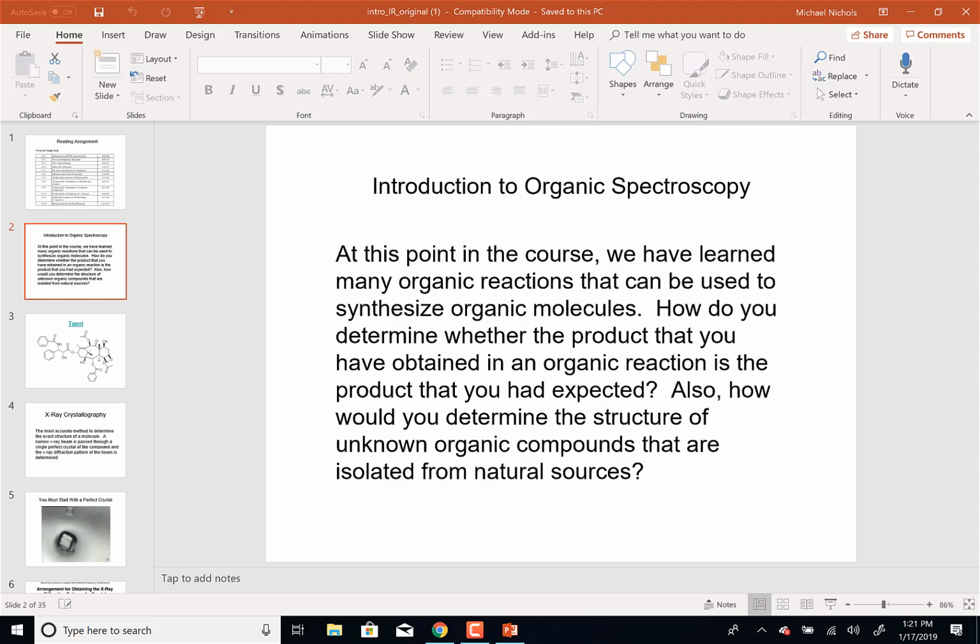Or if you had an alcohol, you might say, I think I have an alcohol. Let me drop a very tiny piece of sodium metal into it. And if it fizzes, because it's producing H2, then I've got an alcohol. If you drop a very small piece of sodium metal in water, it also fizzes before it explodes. Right? Alcohols are going to react slower, and we'll get to that reaction this semester. So we had all these color tests.